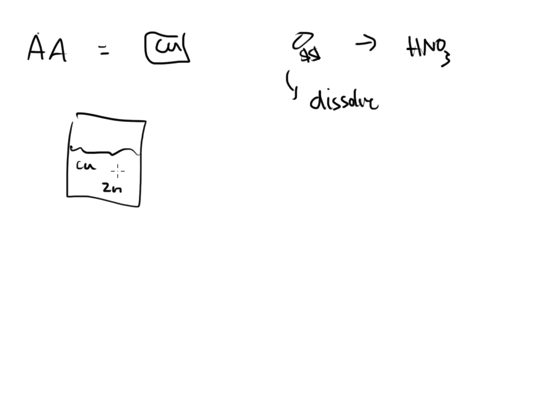Well, the AA doesn't care. What wonderful news. Because that means if I can take a penny and just dissolve it with nitric acid, as long as these solutions are on scale, meaning they're not too high, I should be able to go ahead and pump that solution through the AA and it would read it. Who cares if zinc's present or not? I don't really care if 100 different metals are present. If I have tuned the AA to copper and only copper, it will only look for copper. It won't look for anything else. This is what we need. This is going to make our life much easier, right?